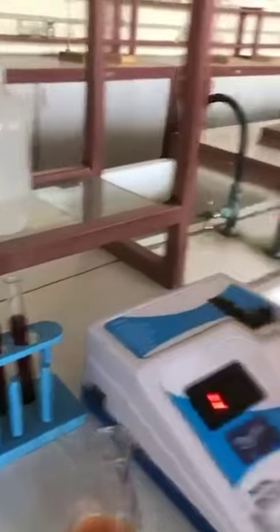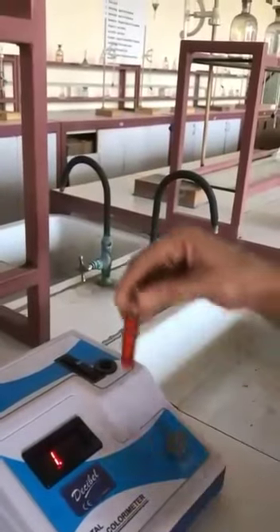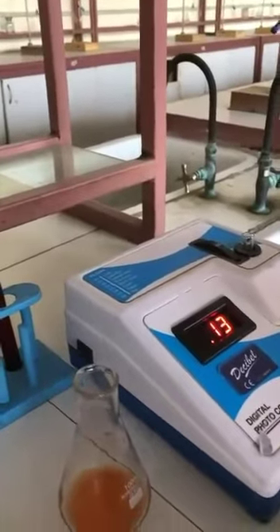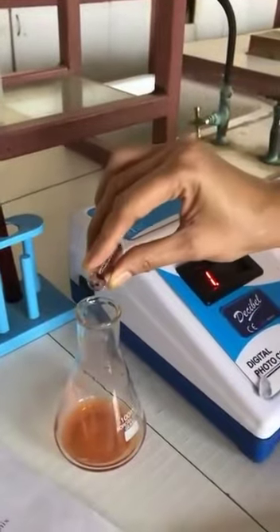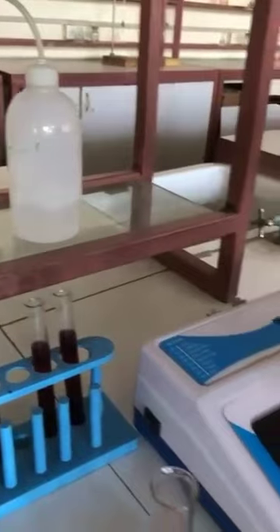Now, take the third test tube. Fill the cuvette 3/4. Dry with filter paper. Insert in the colorimeter. Now, the reading reported is 0.13. Now, take out the cuvette and pour the solution into the conical flask. Now, take the fourth test tube.